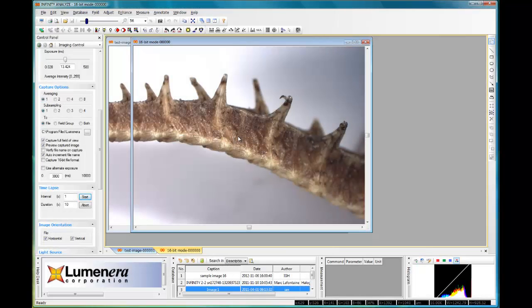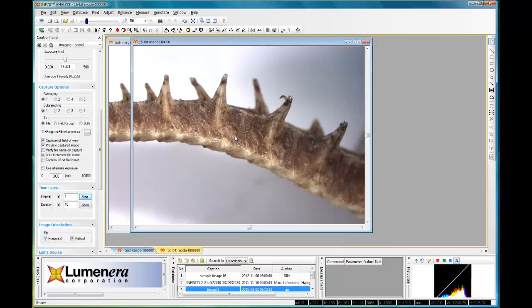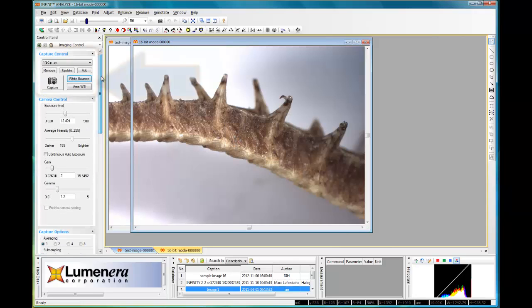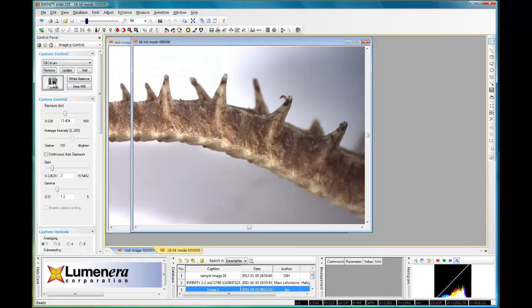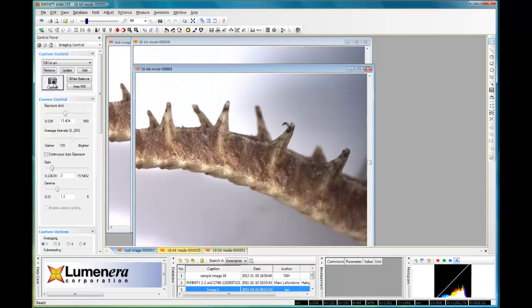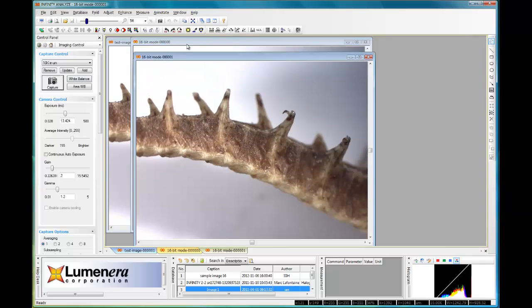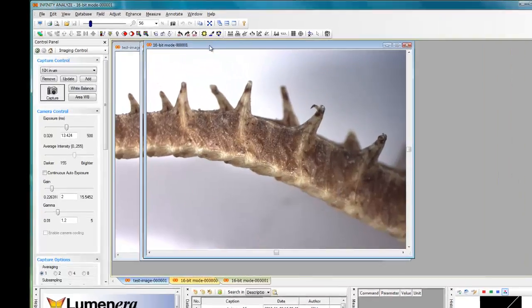And lastly, in today's tutorial, I want to talk about different ways of capturing images. So on the control panel on the left hand side, the most prominent button is this capture button here. Clicking the capture button will give me an image on screen.